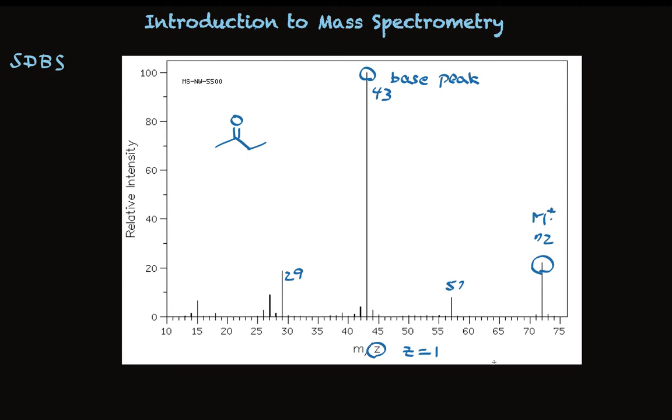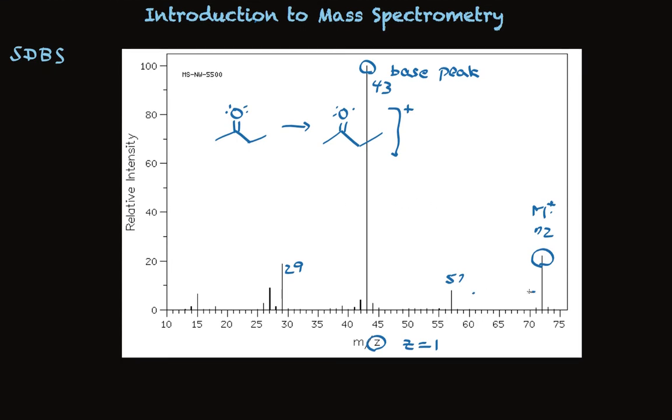And there is some rationality to how this actually happens. To form the molecular ion, one of those carbonyl electrons is lost, and that leaves a positive charge. The fragment we see to go from the molecular ion to this one is minus CH3, 15. And we can understand how that happens. If this bond is broken to create a fragment where we're losing CH3, the fragment we make permits a filled outer shell of all atoms. So the loss of this methyl group makes a lot of sense.